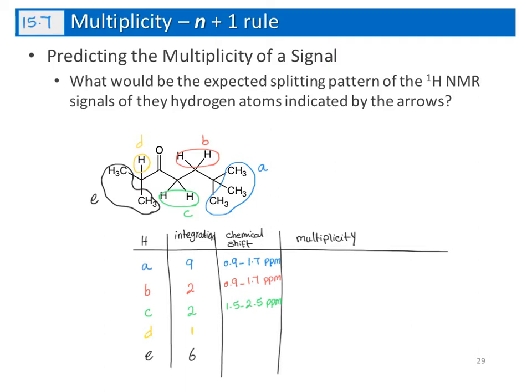So it should have almost the same chemical shift, 1.5 to 2.5 ppm, with the green hydrogen. So both of them, yellow and green, have a kind of similar chemical shift. Now with the black, again, this hydrogen is connected to the carbon. That carbon is connected to the carbon. So there is no electronegative atom here. So they are alkane. And alkane, we expect to see them between 0.9 to 1.7 ppm.